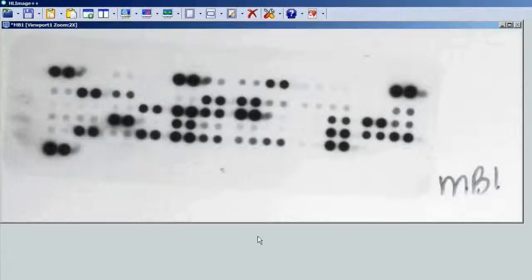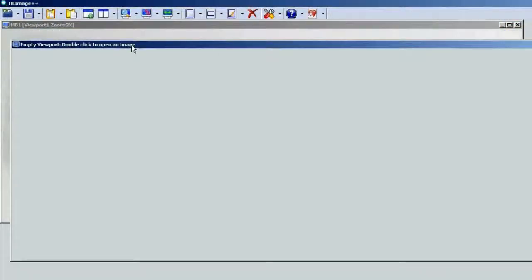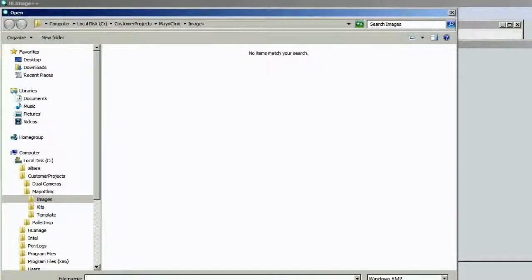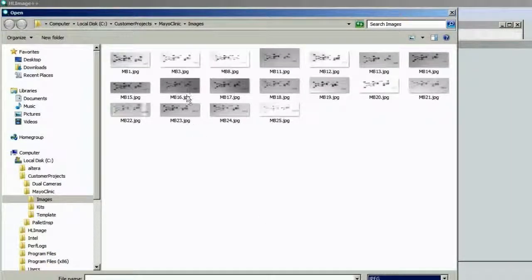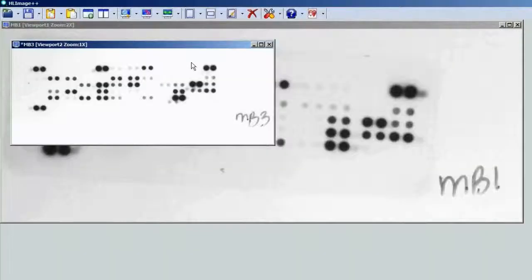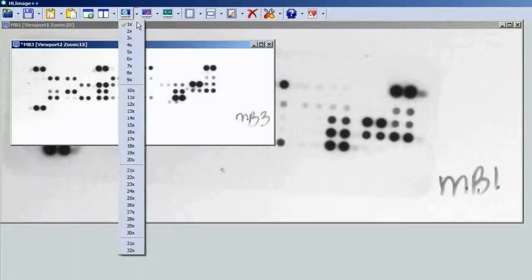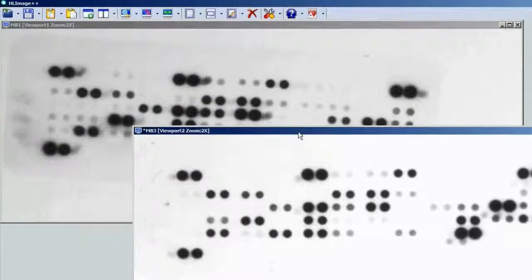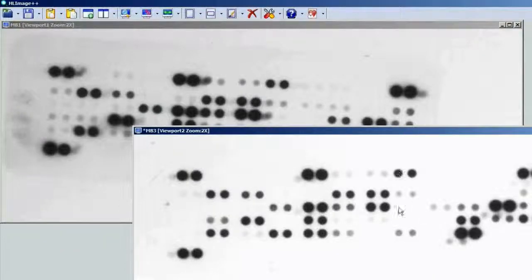Now is a good time to talk about calibration because it's the first step we need to do. Let's open up another viewport and open up another image — the next one — and zoom that up. We will notice that the manner in which it was scanned is not exactly in the same place, so this image is vastly different than the first.